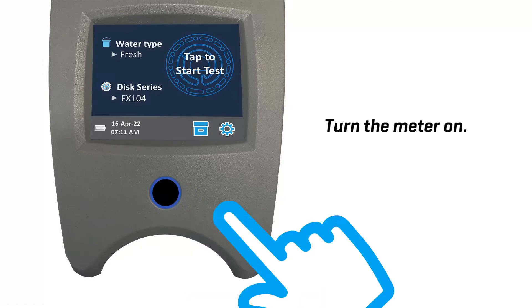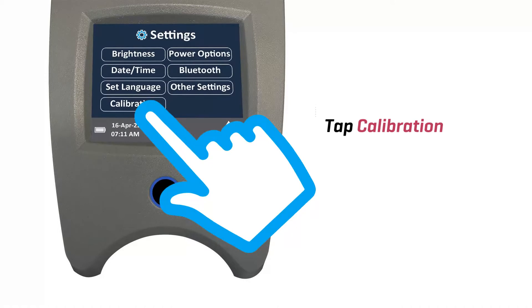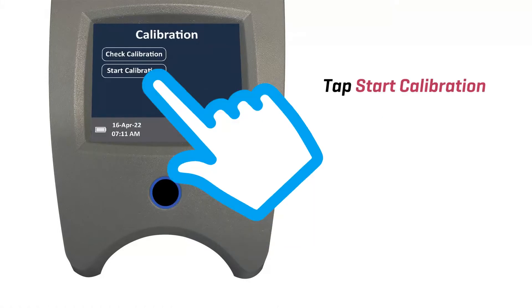Turn the meter on. Then tap the settings icon. Tap calibration. Tap start calibration.